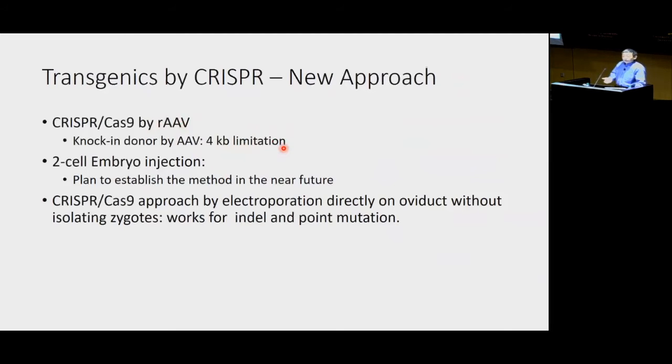So this is actually a single-strand DNA. As I mentioned, people also found that if you synthesize a single-strand DNA, you can just go to some company now, and they can synthesize the DNA for you. It's very quick. That also improves the homologous recombination, and that improves your chance to get the mutations. I did one such project successfully in the mouse genetic lab. Plan to do more.